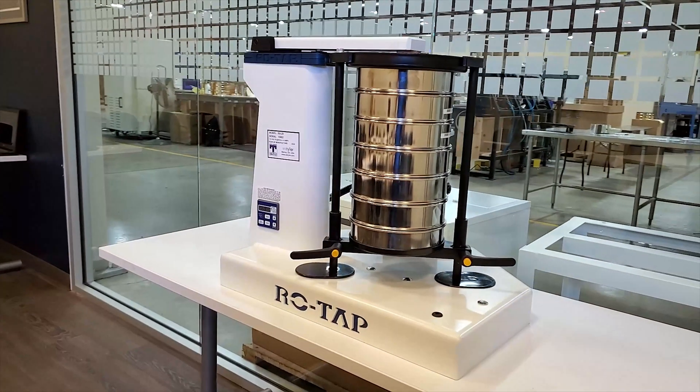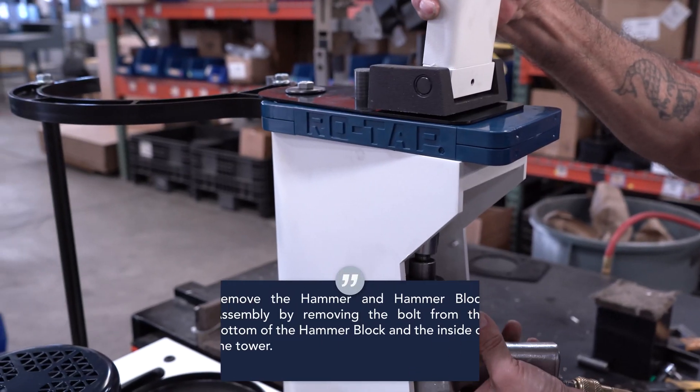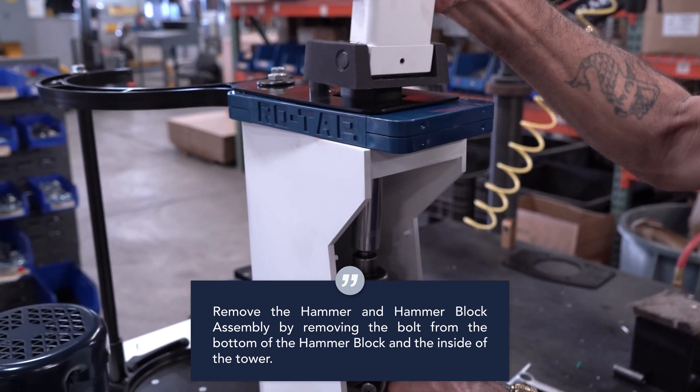Unplug the machine and remove any sieves or loose items. Remove the pedestal cover from the side of the tower. Remove the hammer and hammer block assembly by removing the bolts located at the bottom of the hammer block and the inside of the tower.